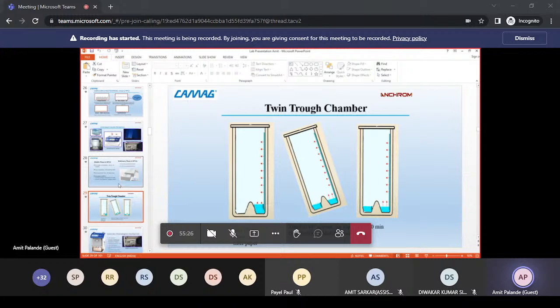Then after development, the next step is the photo documentation step. For this step, you can use this visualizer. This visualizer has a high definition CCD industrial camera, which gives three illumination modes: HD photos, a white light photo, then UV 254 nanometer, and 366 for the fluorescence. So here you can see how you will get the photos from the visualizer.